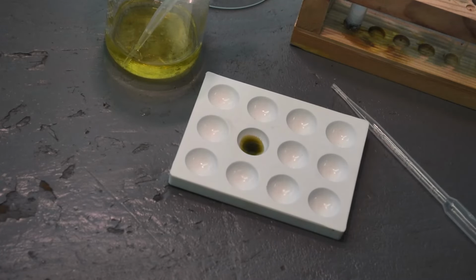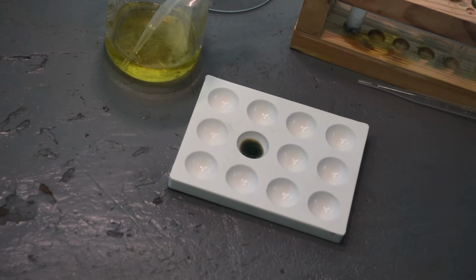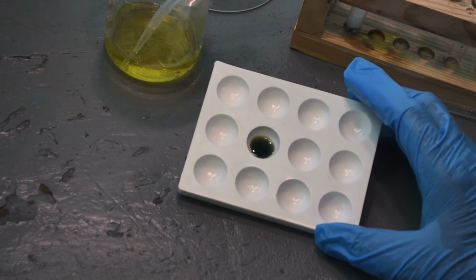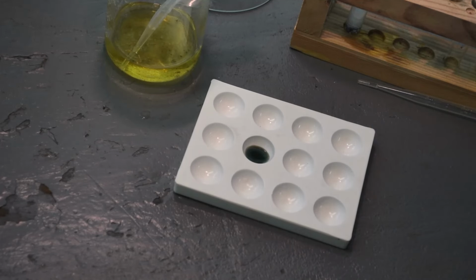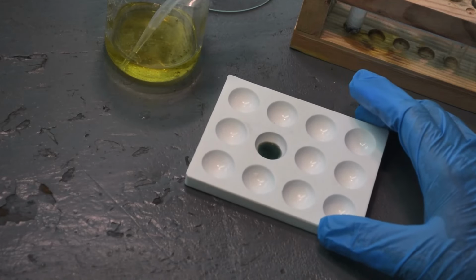I would say we've got some palladium here. Yes. So yes, Joven, it looks like there is some palladium in this stuff. Oh yeah, it started out very orange and now it's very green. That looks to me like the signal for palladium. Oh, all right. Sorry if I doubted you, Joven. I think you said this stuff was gold plated. I don't know how they got the gold off without stripping the palladium too, but yeah, there is palladium there.